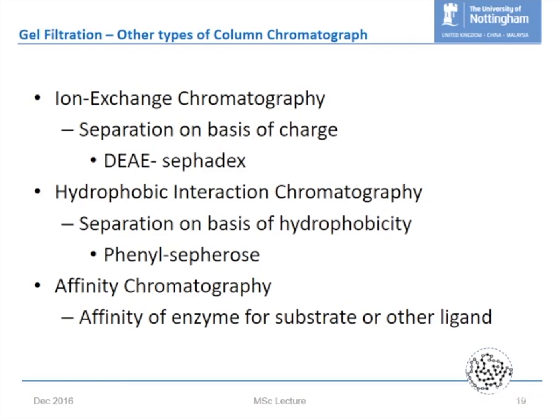And incidentally, one thing that you might consider is when we work with GPC, we just have a standard mobile phase running through our column. We don't change that mobile phase, it stays constant. In a lot of chromatographies, when a molecule absorbs onto the surface and is held on the stationary phase, we can actually encourage it to move. And we can encourage it to move by changing the solvent strength.